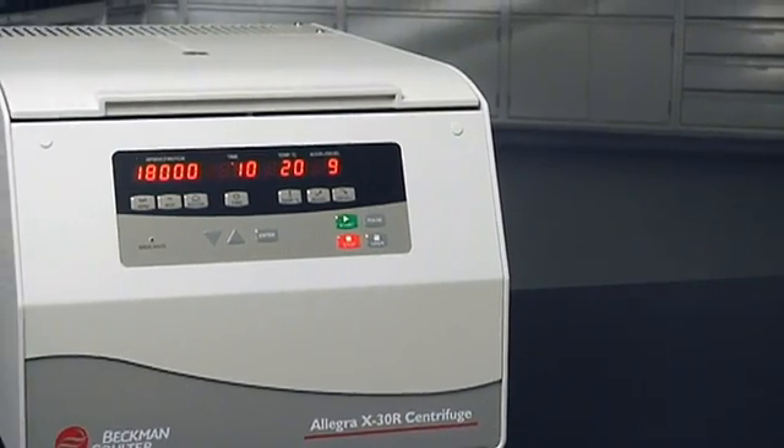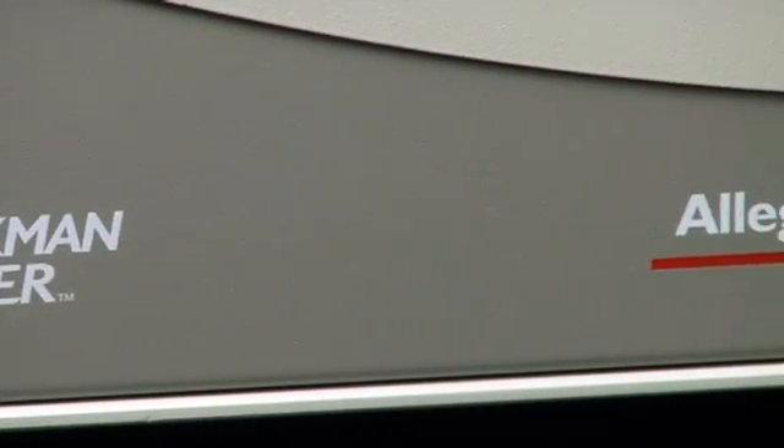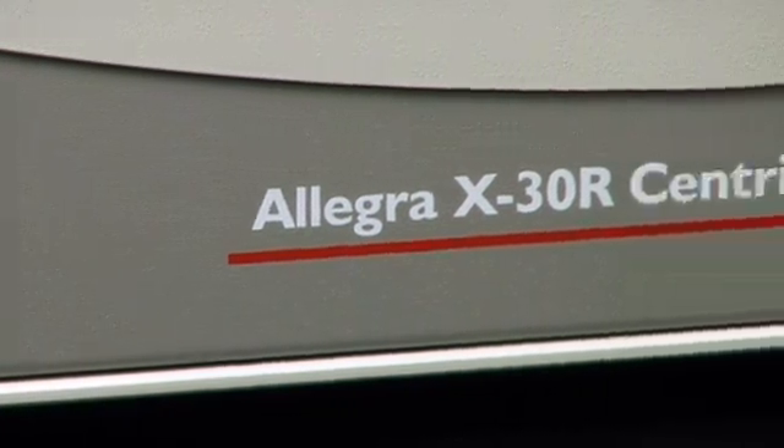The large interface makes your run protocol easy to see, follow and execute. Another way the Allegra X30 is improving your experience in the lab.